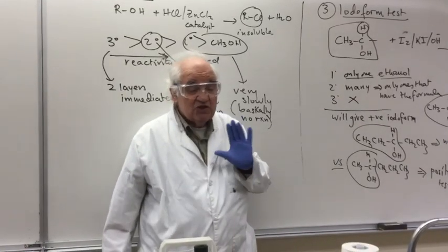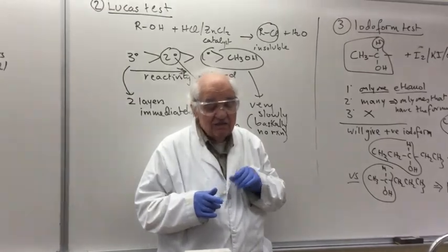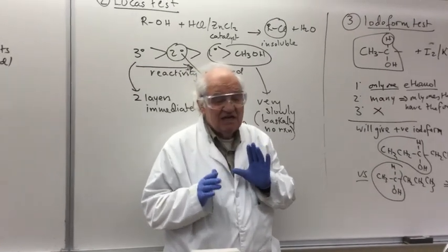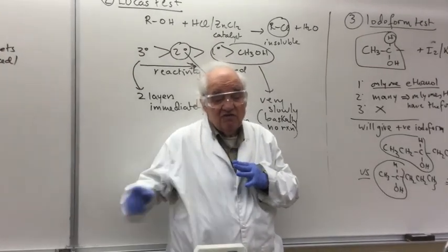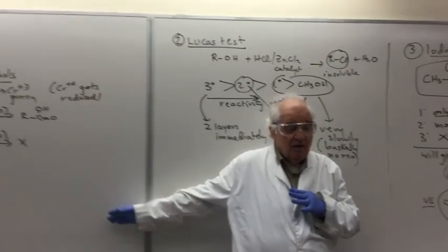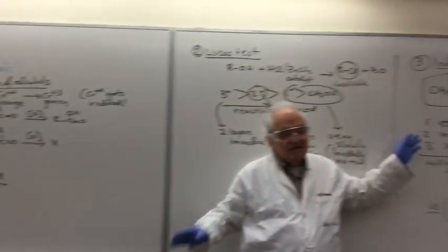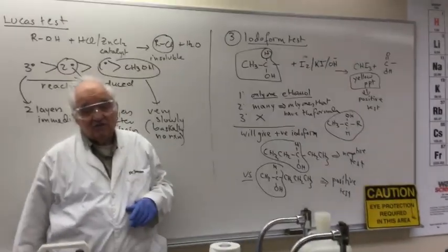Now, there is a possibility that more than one compound matches the number 5 unknown results. It doesn't really matter, but you can say for sure, you can exclude the fact that we know it is not a tertiary one, that most likely it's a secondary one, and most likely it's a secondary one that does not have the CH3CHOH.